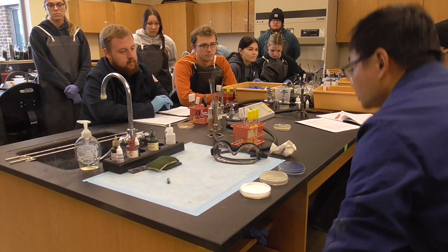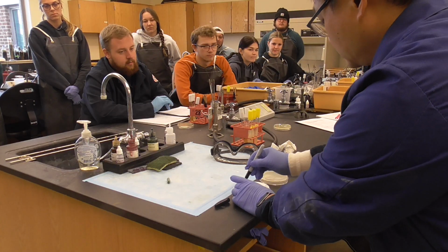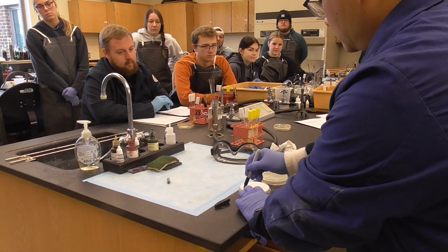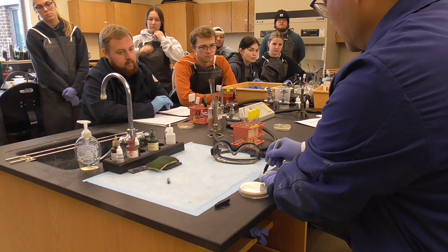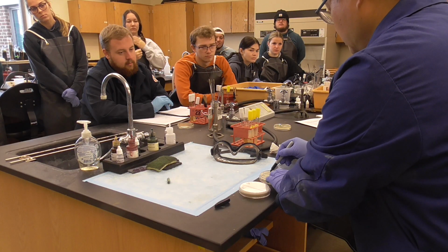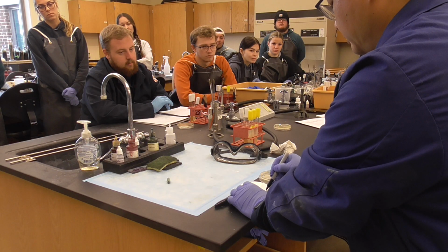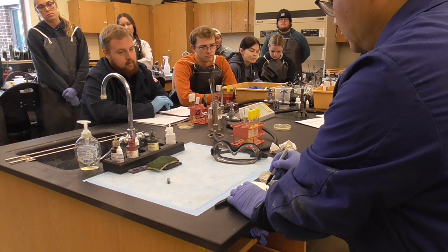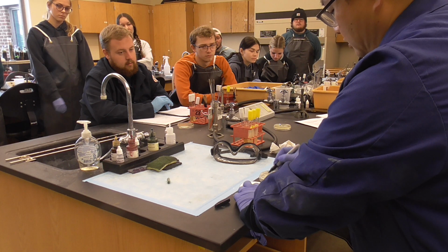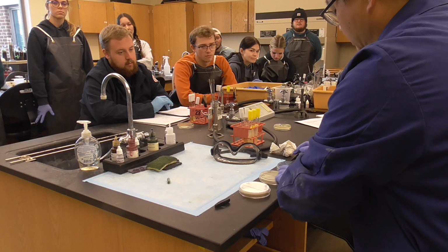Where's the marker block? Okay. You can label it like this: EC, E. coli, Bacillus subtilis. Put your initials inside, the date, 1028, your initials, bench number, and date.